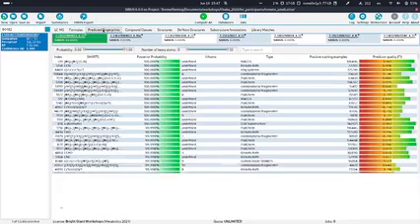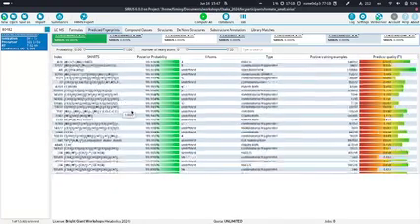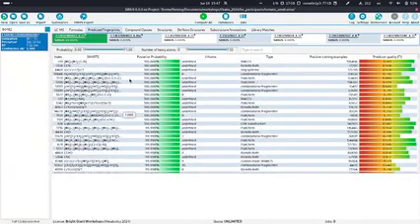Okay, then the next step we are going to look at is the predicted fingerprints. So again, the formulas and the predicted fingerprints, this is still de novo. Here we are trying to see which properties belong to the data we have measured. You now have a very long list of properties, and often if you want to look at this in more detail, it might be good to search for something, for example, or to filter this list a little bit.